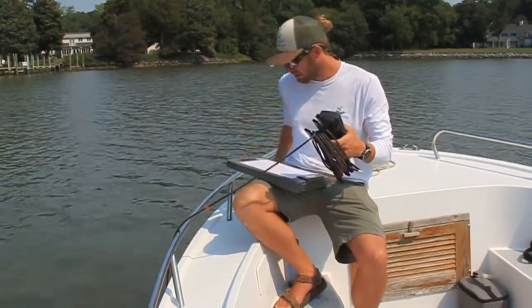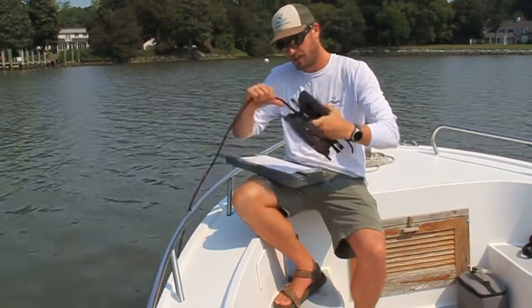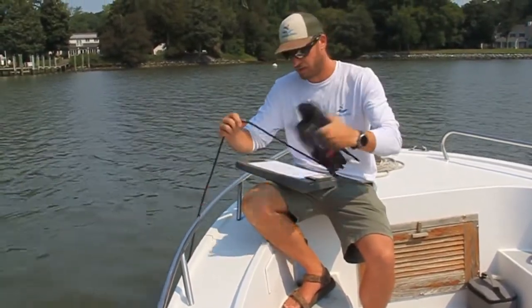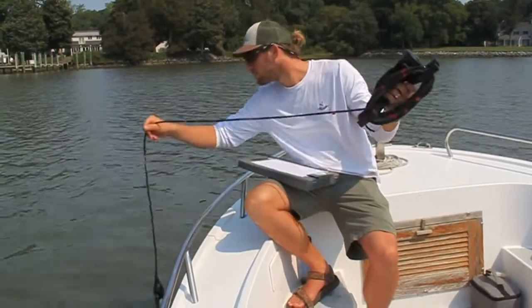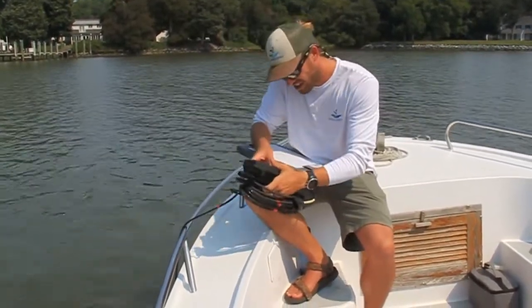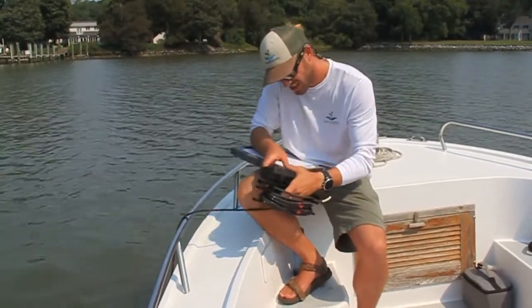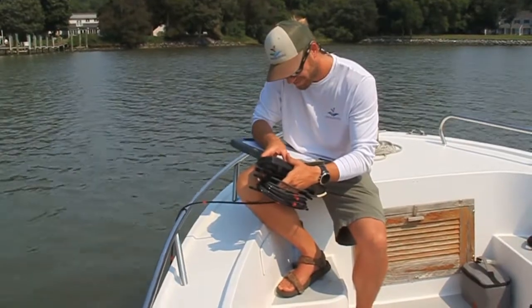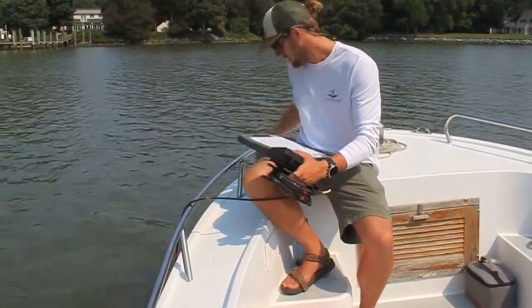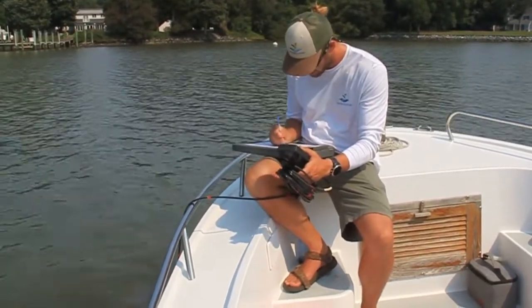So once we get the bottom reading, we'll then wrap this up and come up to the surface, where we'll strive to get a reading at about 18 inches, so about 1.5 feet below the surface of the water. So I can pull it out here and then drop it down. It tells us right on these meters exactly how deep we are for that reading. So there we are at 1.5 feet for our sample depth.